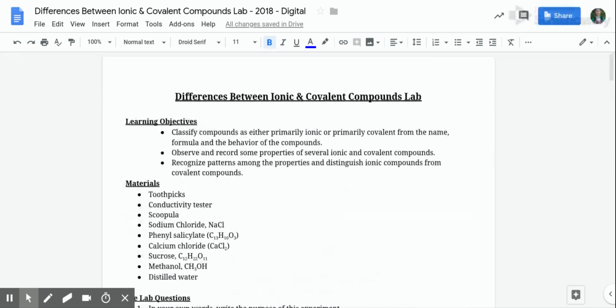So this video is to basically help you prepare for the lab tomorrow. It gives you a little bit of background so there are fewer questions. If you do have questions, though, feel free to ask. Big things tomorrow in this lab, since it's our first lab: safety goggles have to be on. Proper lab safety procedures also have to be followed.